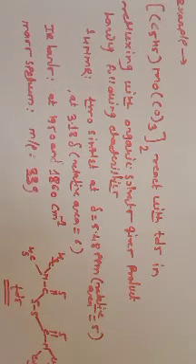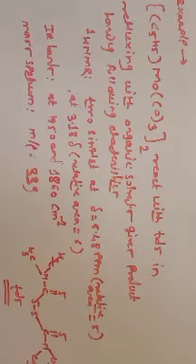By refluxing in an organic solvent, it gives two singlets at 5.48 ppm and 3.18 ppm with relative areas 5 and 6, strong IR bands at 1950 and 1860 per centimeter, and the mass spectrum shows m/z 339 after elimination of a single valence electron from the product.